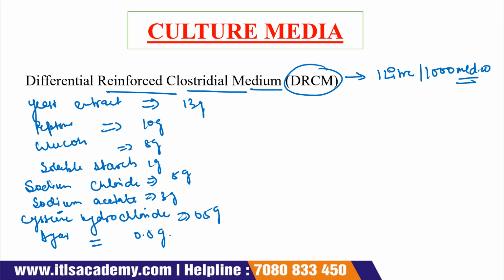Okay, all these ingredients are first dissolved in 500 ml of distilled water.